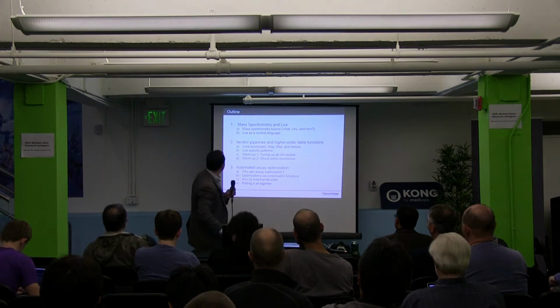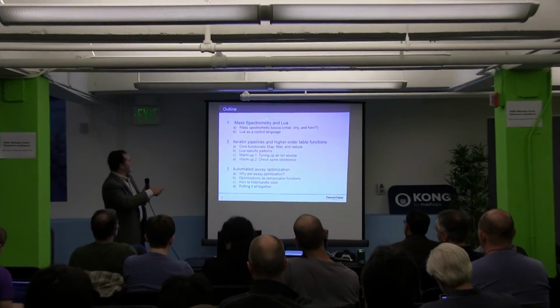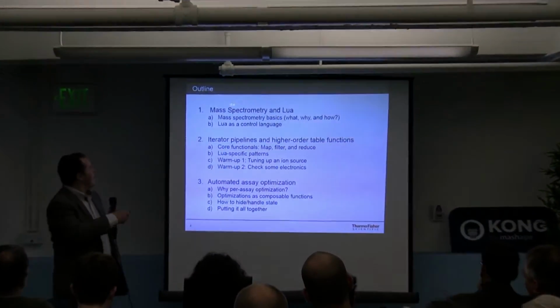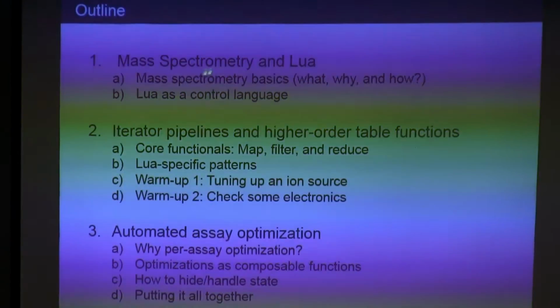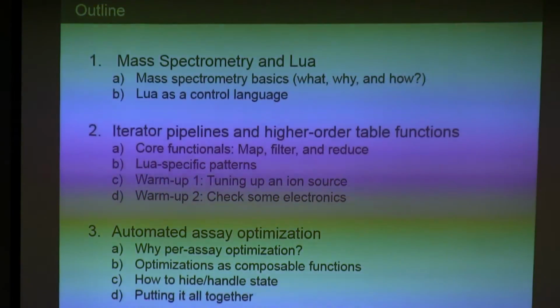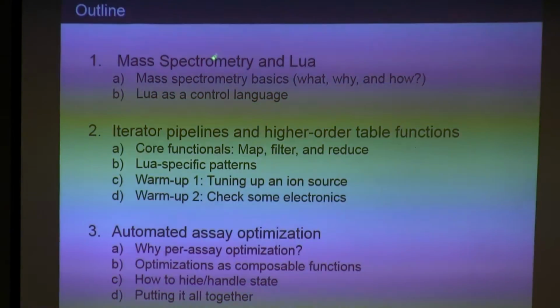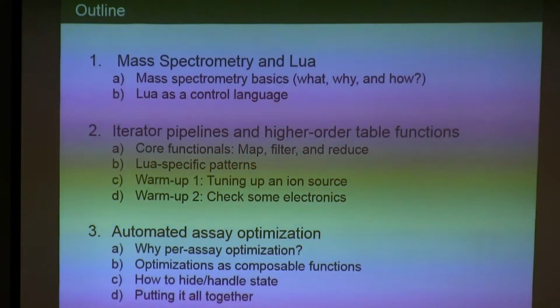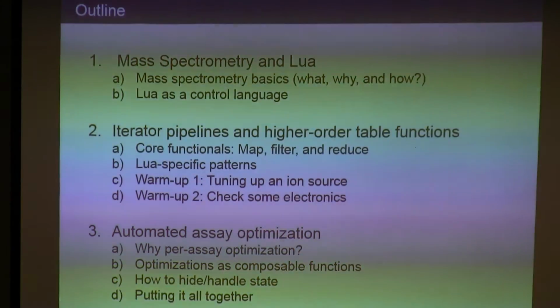So, the structure of the talk, what to expect. First, talk a little bit about what mass spectrometry is and how we use Lua to control such an instrument. It's not entirely a trivial problem. Not going to get deep into physics or analytical chemistry, so no real need to worry. It's all going to be qualitative.